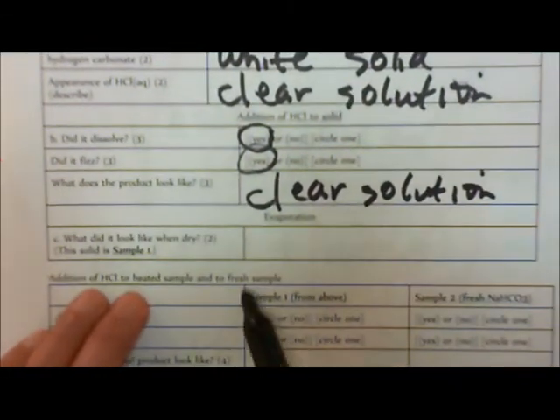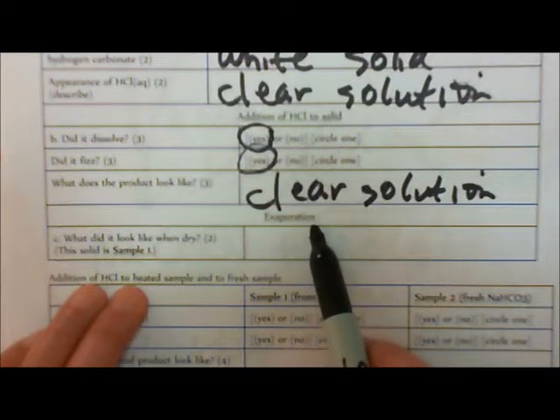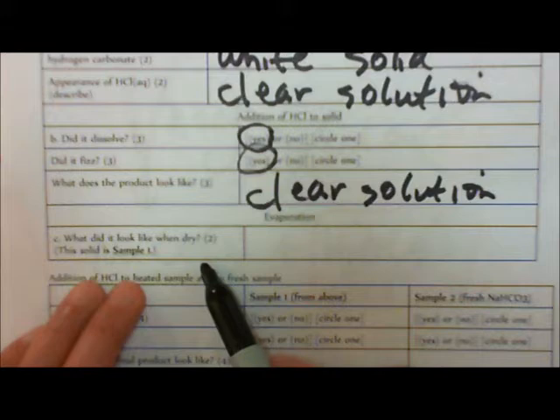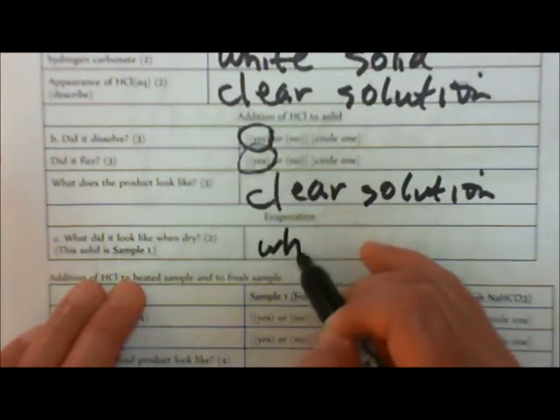Then what you're going to do is evaporate it. So that's the little process that you do, the evaporation. And what did it look like when dry? This is the solid in sample 1. This should look like a white solid.